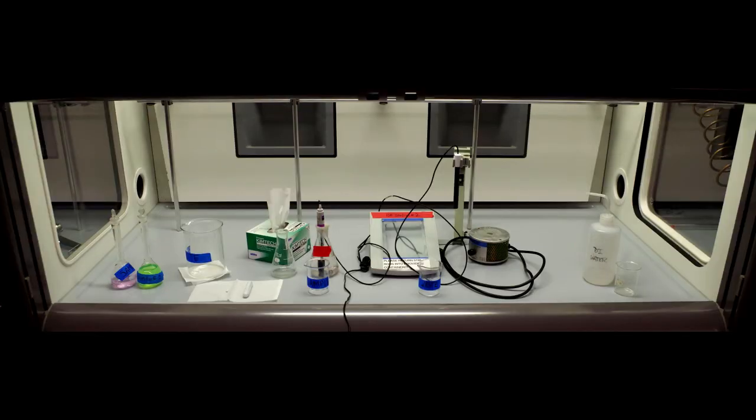When you are finished the experiment, rinse the electrodes and the stir bars with deionized water. Put the ion selective electrode back into the electrode arm and place the reference electrode in a 0.05 molar potassium chloride solution.